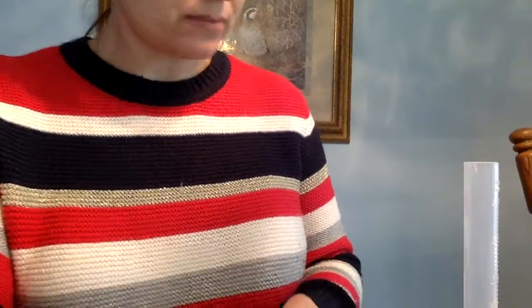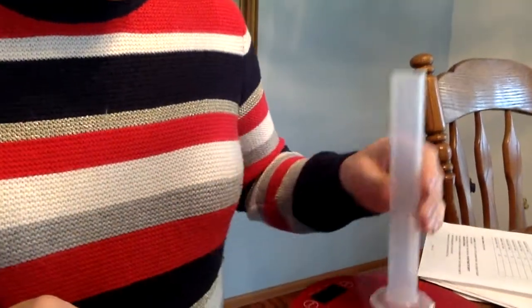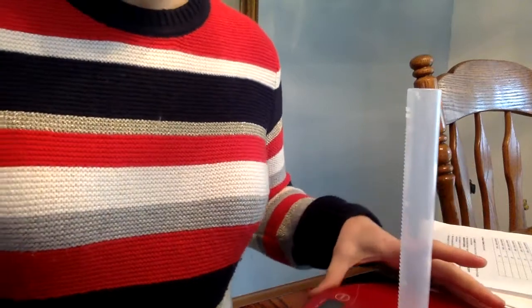Then what you're going to do is take your graduated cylinder, fill it up with 5 milliliters. Use your dropper because it will be easier to get it to the exact line. And then get your scale, and weigh your 5 milliliters with a graduated cylinder and record that. Once you've done that and recorded, get 5 more milliliters, so get it up to 10 mil and record the mass again. Get it to 15, 20, 25, up to 30 milliliters.